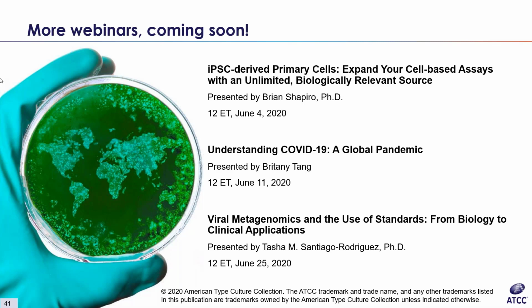All right, let's move to the next question. What cell lines have been evaluated for transfection with GenX Plus? With GenX Plus, we have two general protocols: one for general suspension cells and one for adherent cells. We don't have as many optimized protocols as we do for the other reagent. But if you go to the GenX Plus product page, the protocol will be there, and if there are any specific ones, they will be listed there. But most of our optimization has been done for the other reagent.